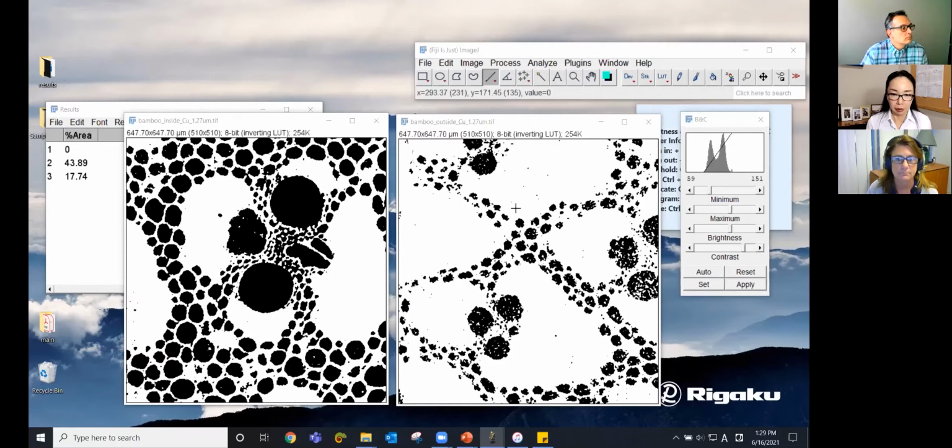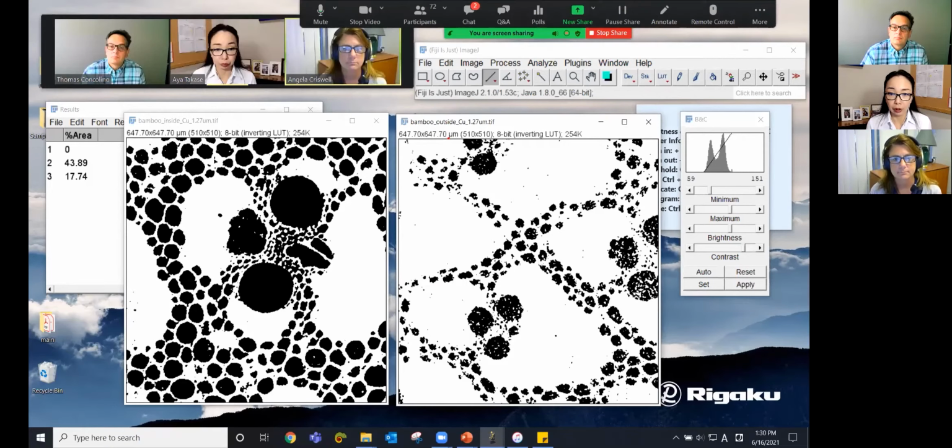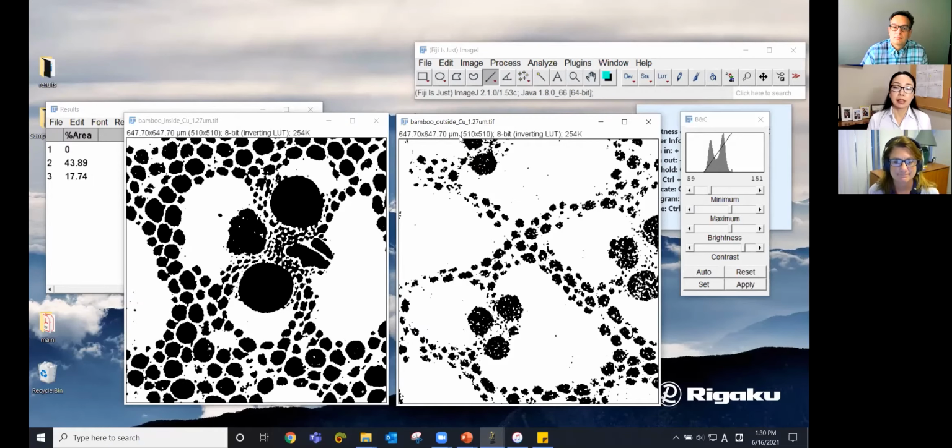Generally speaking, you can actually tell if the voxel size is set or not by looking at the unit at the top of the window. So just to highlight it so you can see it, it's right here. It's tiny, but it's there. And if this is not pixel, but microns or millimeters, then most likely the voxel size is already set because TIFF files can have the pixel size information in the header. But if you're not sure if this is correct, then you can always go to Analyze, Set Scale to see what was set. And if that's incorrect, you can change it there.